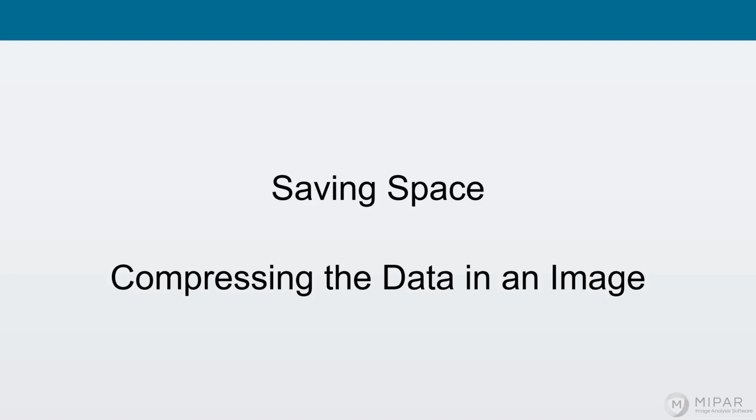Our next point is image compression, how the data in the image is actually stored on your hard drive. So sometimes image files can get massive. If you have really fine resolution, if you have 3, sometimes more channels depending on the instrument, I've seen images up over 300 megabytes for a single image. It's just giant.